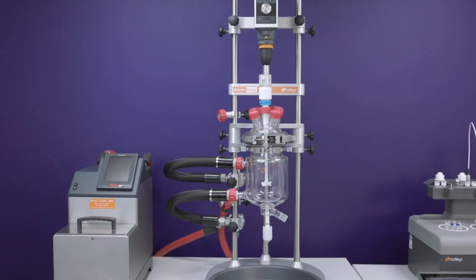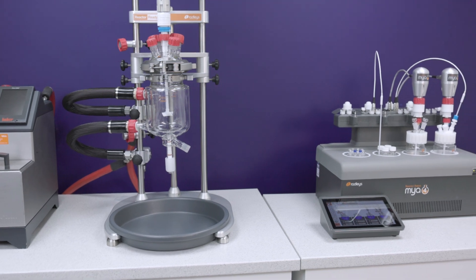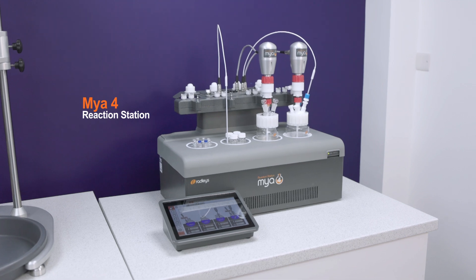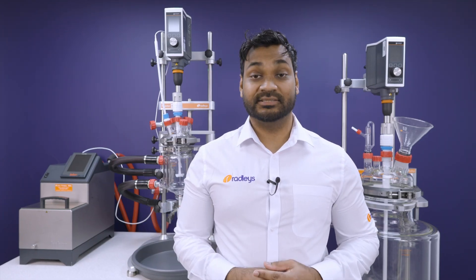We design our systems to make your manufacture precise and consistent, but also flexible. If you want to do some process development or manufacture at a smaller scale, check out our video on the Mya 4 reaction station. We'd love to discuss your application with you, so please book a demo with one of our experts to find out how we can help accelerate your project.